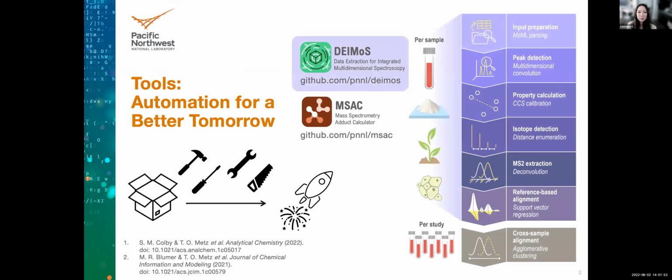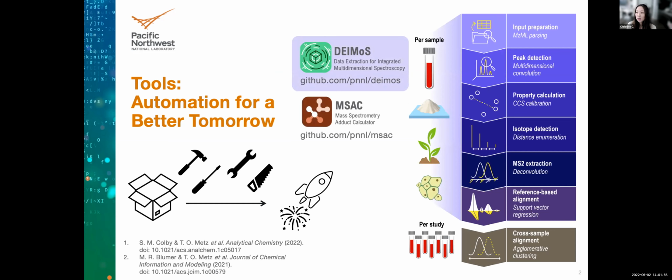means. But what I'd really like to highlight is our tool DEIMoS, which is a powerful and open source data processing tool with multiple built-in utilities that are shown in this figure. DEIMoS includes many functionalities and also a very accessible API that allow us to select which pieces we need for each particular data processing stream, and can also handle multi-dimensional mass spec data in 1D, 2D, 3D, or beyond. And our idea was to use the powerful functionalities of our tools to build our spaceship, which in this case is a fully automatically generated library of collision cross-section or CCS values based on experimental data.